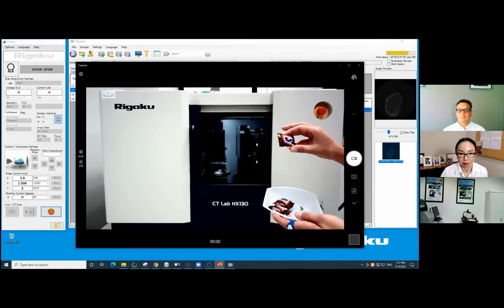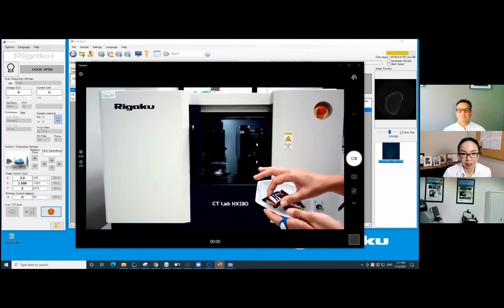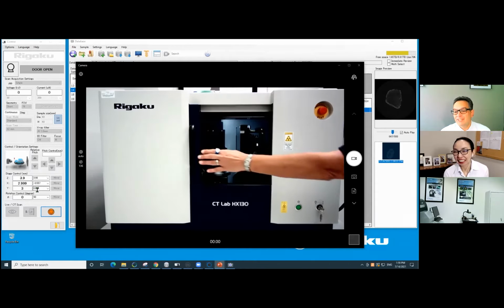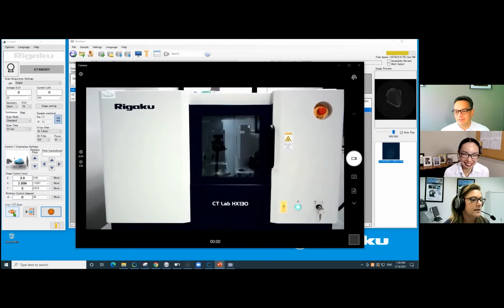Is it S, is it N, or is it R? I'm going to present a poll, so you pick, and then we'll image that. Obviously, this is not a question to test your knowledge about X-ray CT. There is a correct answer, however, it is not based on anything you have learned today.